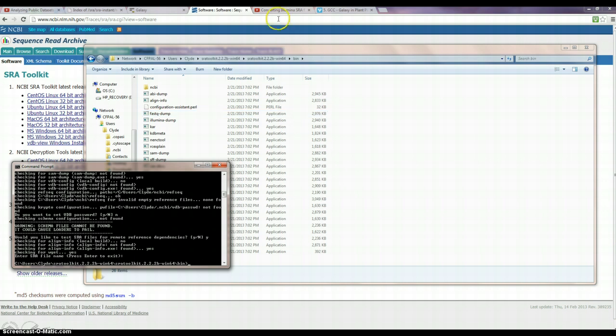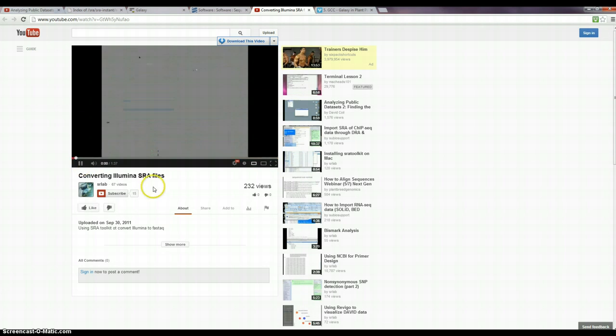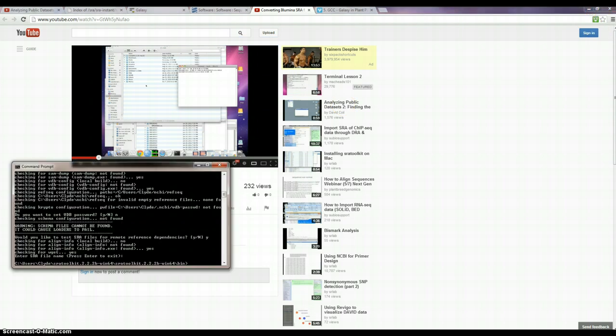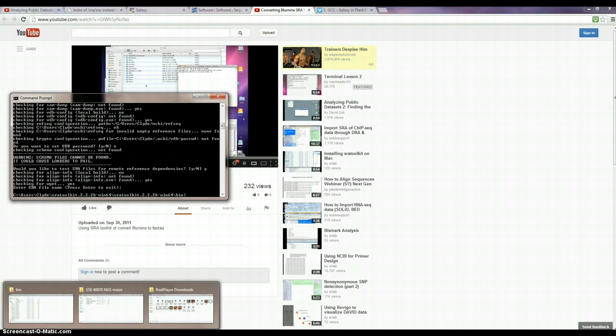So then I searched for a video. This video here, there's no audio to it. I guess there is. You can hear the keyboard. You can't, but I can. Anyway, zooming in on that and getting some help by making mistakes in the command window, I discovered how to put the information in there, and let's get that recorded now.